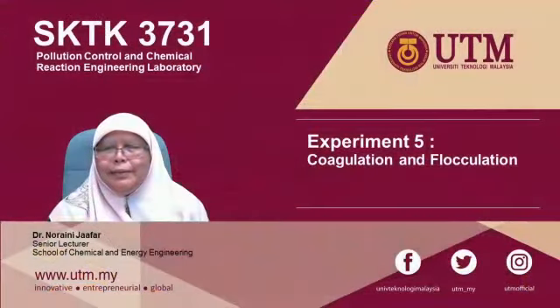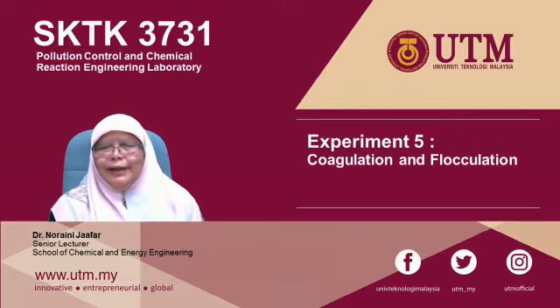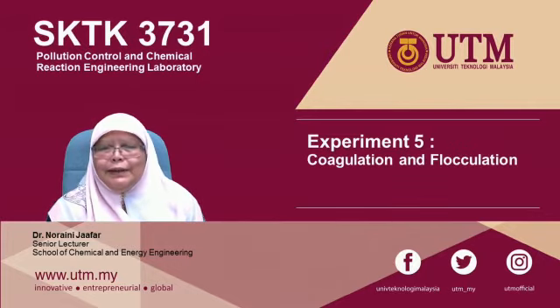Okay, after the experiment, you will use the data to find the colloidal removal efficiency based on the turbidity results. You should be able to select the best dose that results in the clearest water. That's all for the experiment for coagulation and flocculation. I hope you'll be able to discuss the experiment findings in your report based on the data given to you.